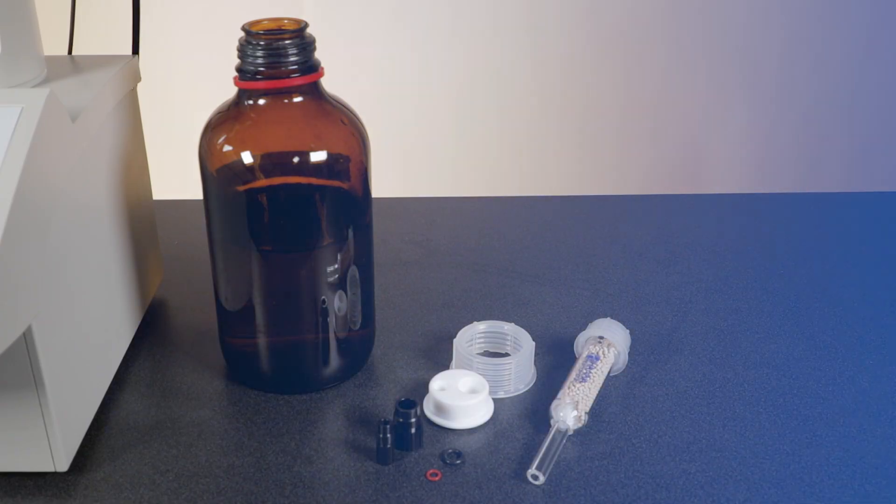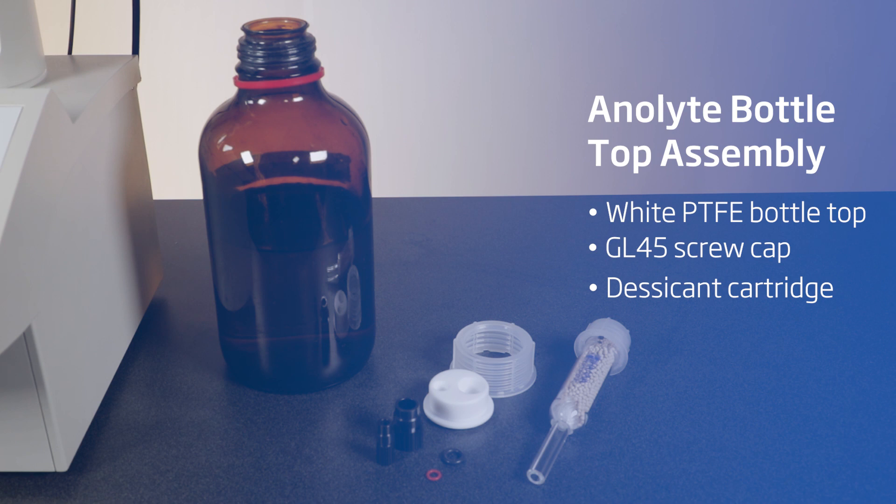For the analyte bottle, we'll need a white PTFE bottle top, a GL45 bottle screw cap and a desiccant cartridge with a hose barbed cap.